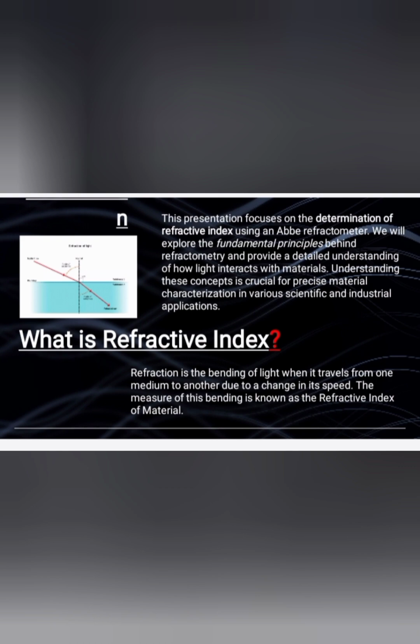Refractive index. Refraction is the bending of light when it travels from one medium to another due to a change in its speed. The measure of this bending is known as the refractive index of the material.